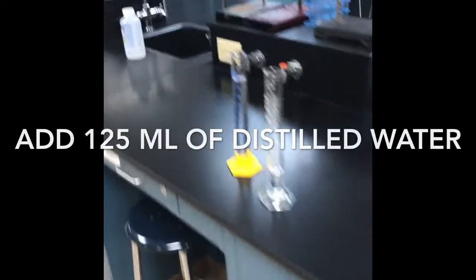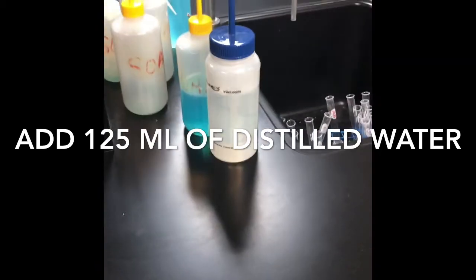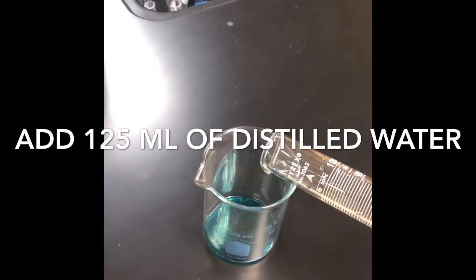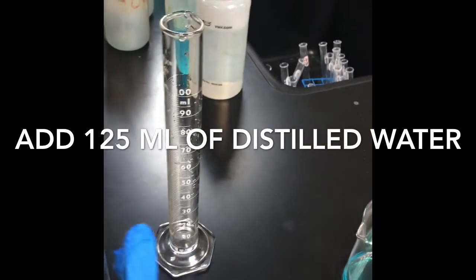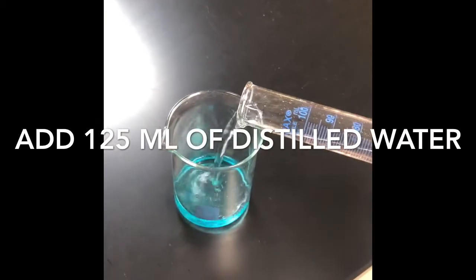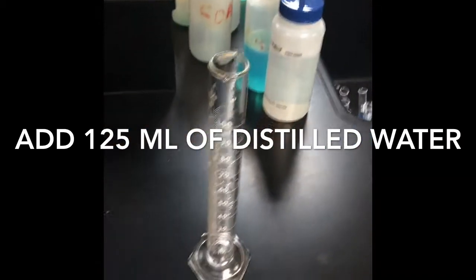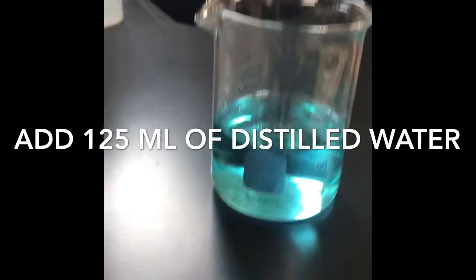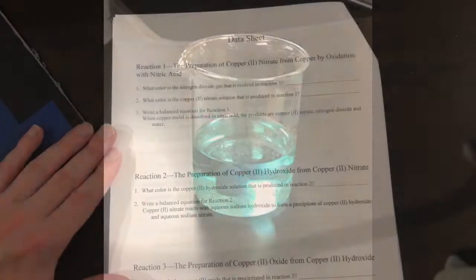So I'm going to go back to the tabletop. I've already pre-measured out my water. Okay, so got 25 here, and we got 100 right here. So note the color. It looks like that. And we'll proceed to the next reaction.